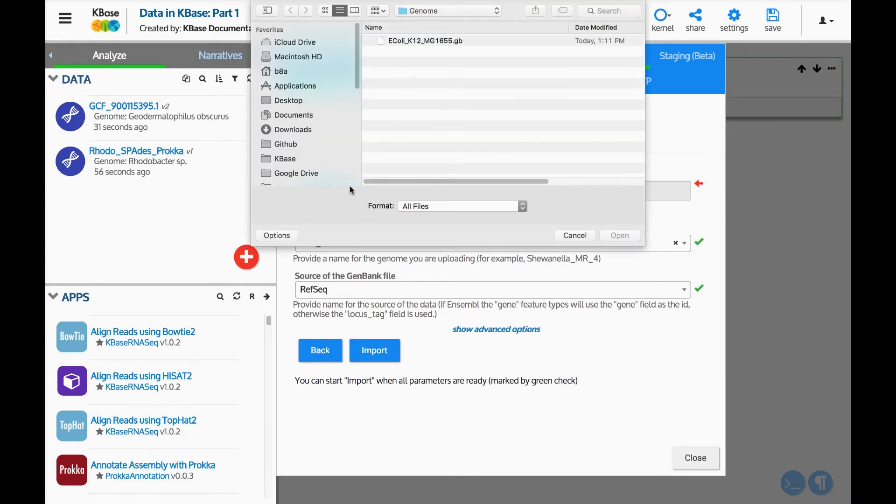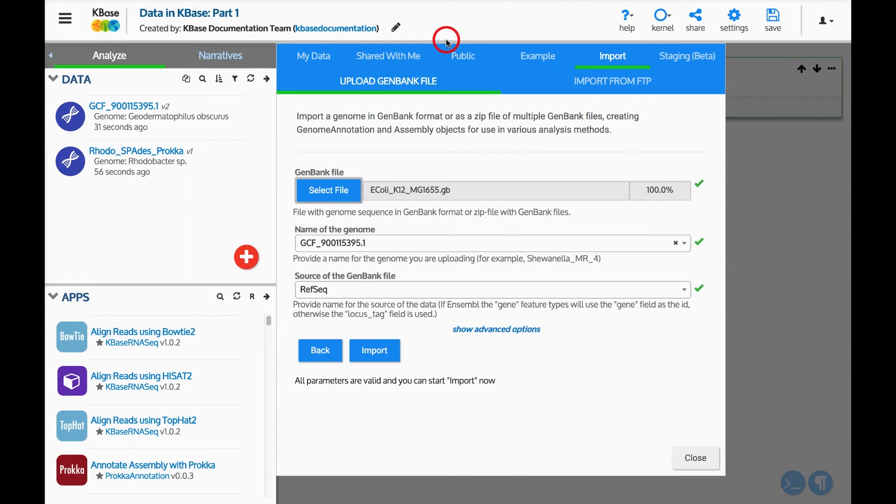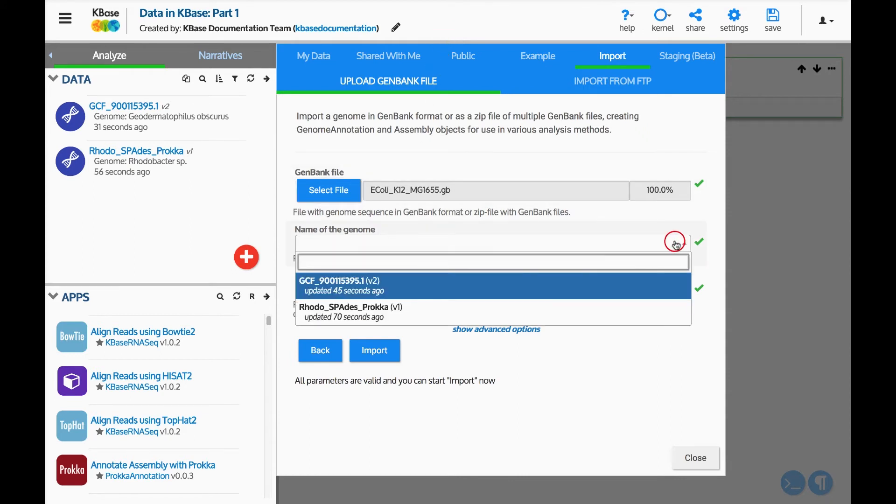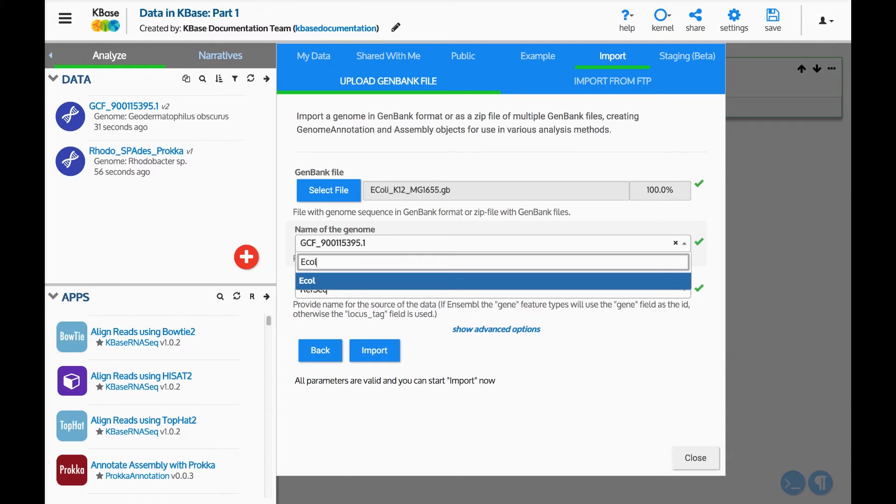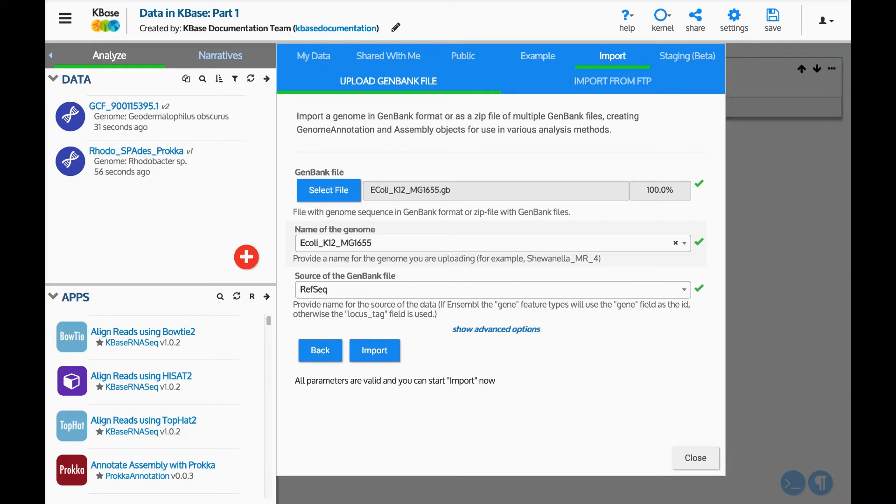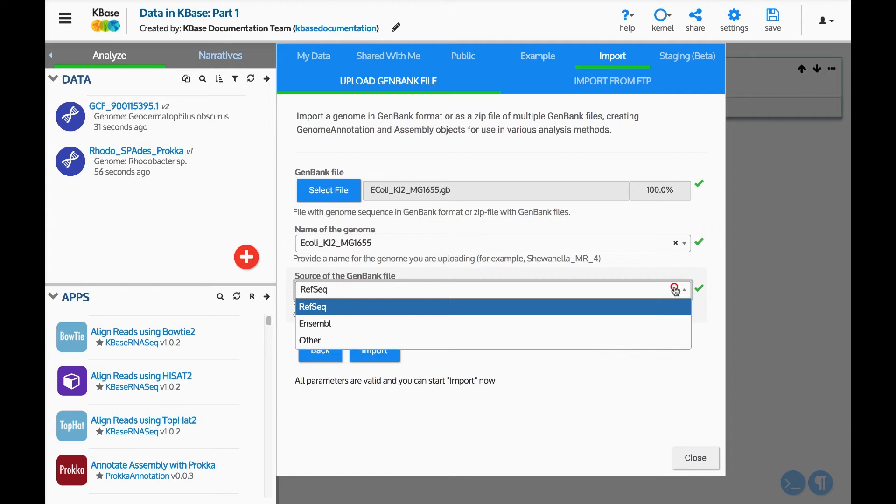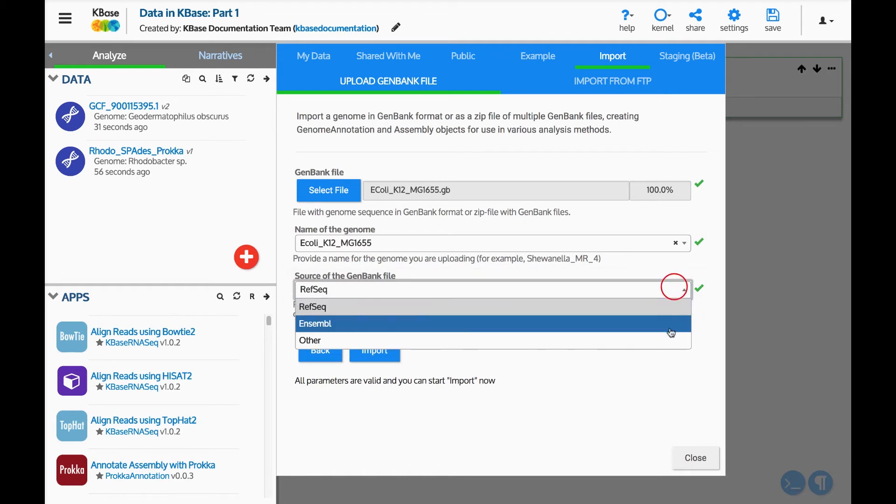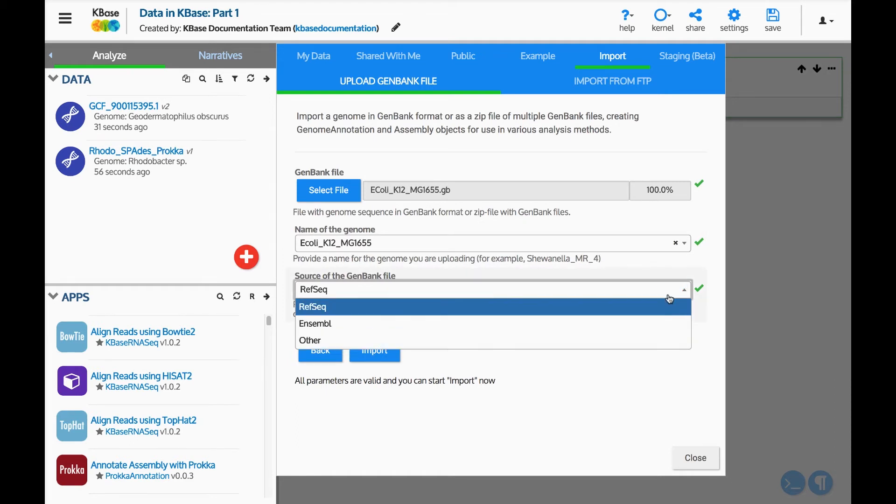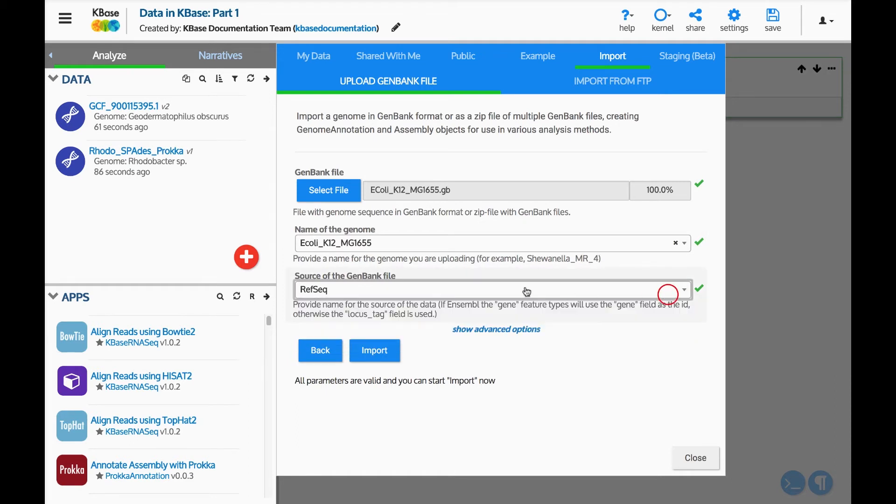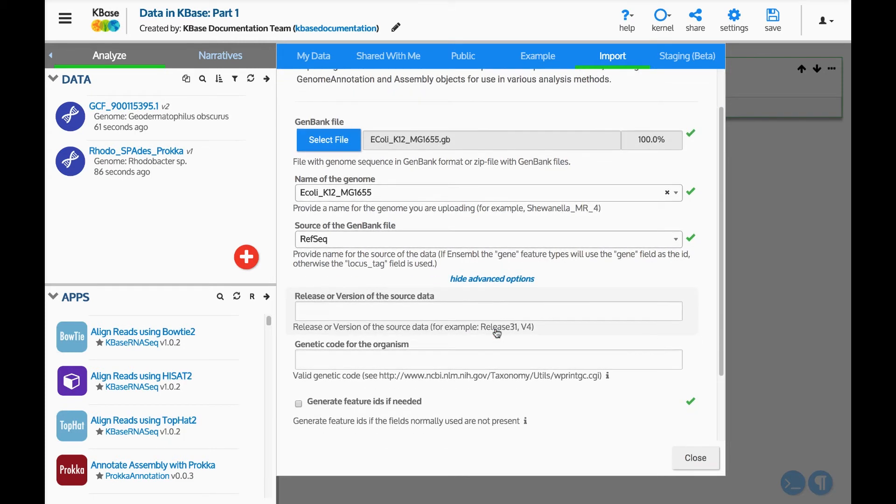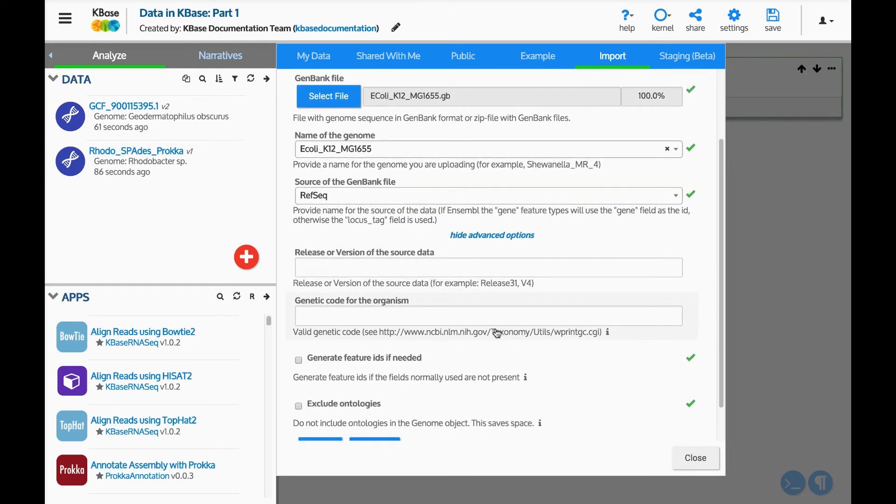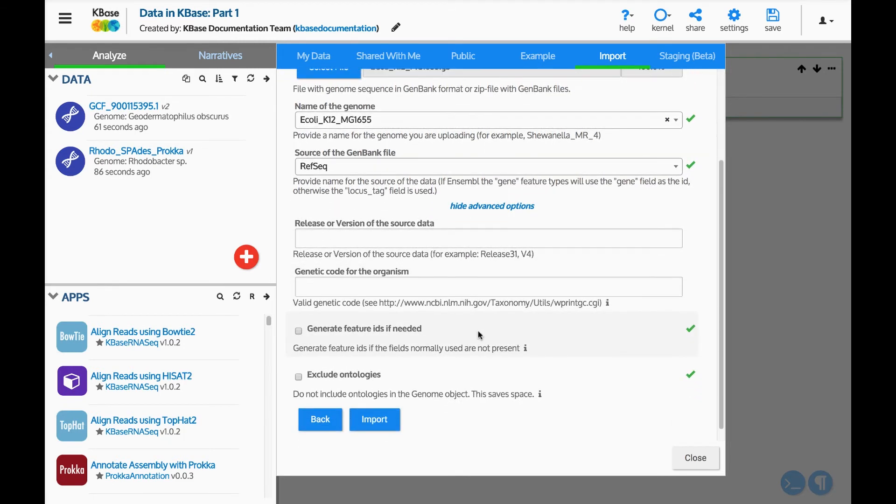First, I will find the GenBank file on my computer to upload. Name the genome that will be added to the narrative. Select the source of the genome. Some uploaders have advanced options. For this genome, select Generate Feature IDs if needed. Once all fields have been completed, indicated by green check marks, start the import.